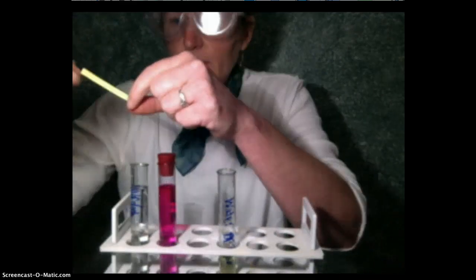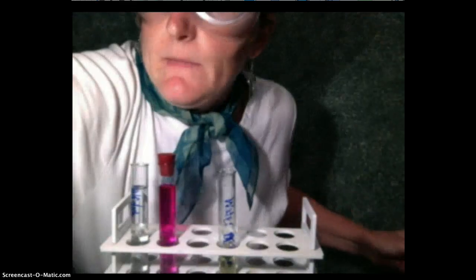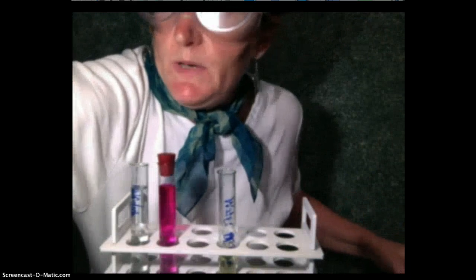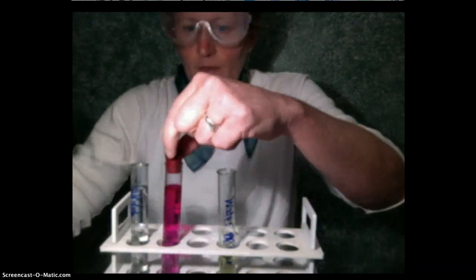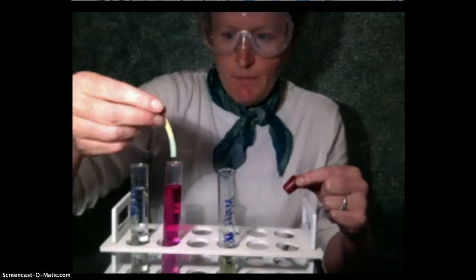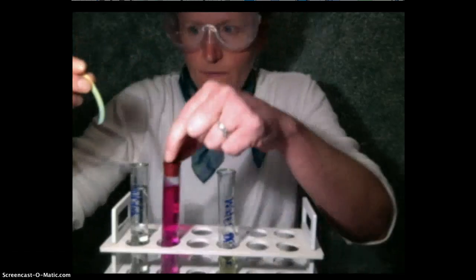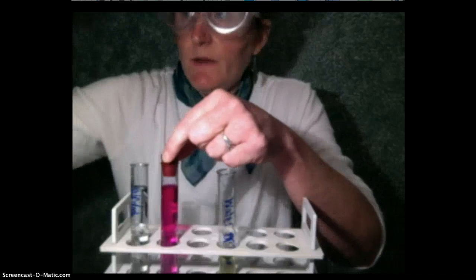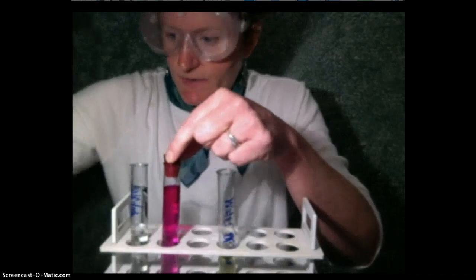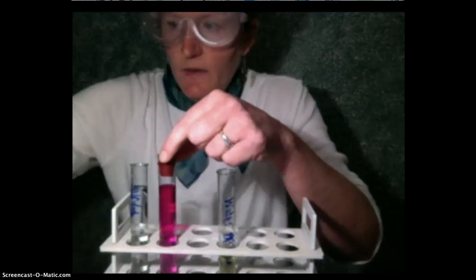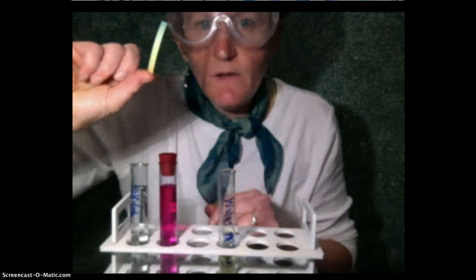If you want to explain bromothymol blue and ammonia at the end of your lab, you can get bonus points. There it goes to blue. Wave it around in the air, get rid of the ammonia molecules that are sticking to the paper. If I let it sit long enough, it'll go back yellow. So those are the indicators.